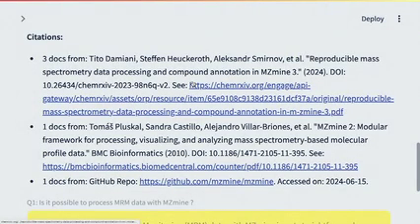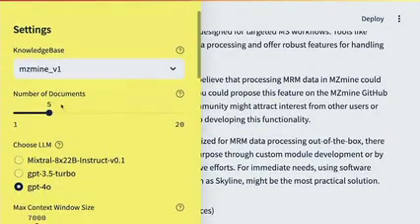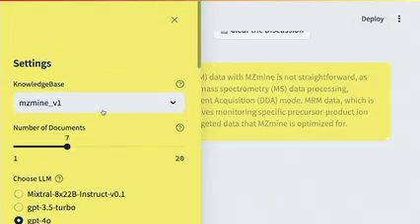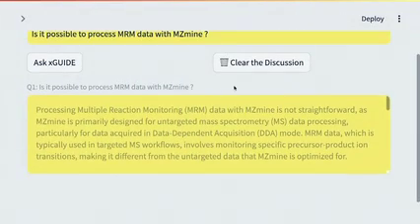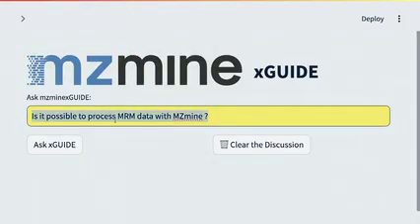Okay, yeah, maybe. So we're definitely working on this in the future, because that's also something that many people want to integrate, maybe even with untargeted and targeted data, right? And then, yeah, so it's not very straightforward. There are some ways to convert, but not so.